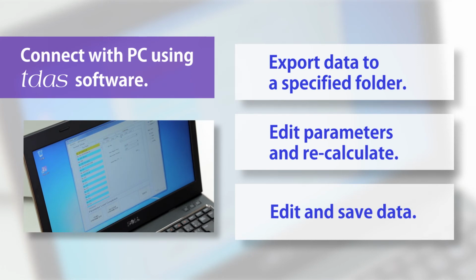The software can also be set up to transmit results to a LIMS system automatically when a test is finished, making this software a very useful tool for customers who want to manage test data on their system.